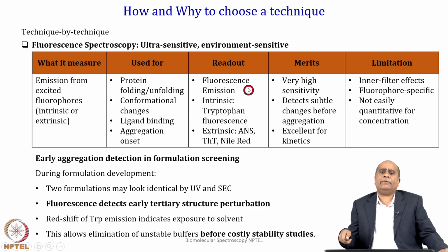The merit is that it is very highly sensitive, detects even subtle change that happens before aggregation, and it is used for excellent kinetics measurement. The limitation is the inner filter effect we had discussed, and it is fluorophore specific and not quantitative for concentration. It gives you structural insight, but not quantitation. Now, one can use it for aggregation detection in formulation screening.